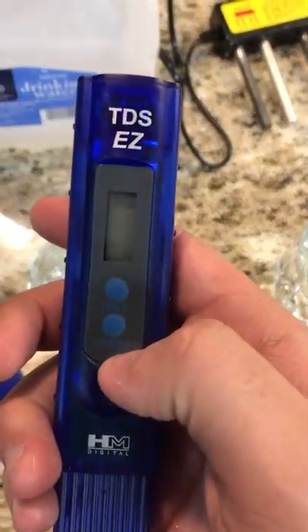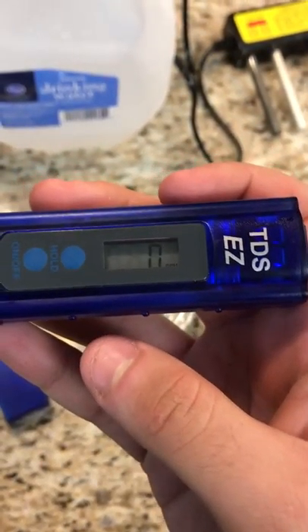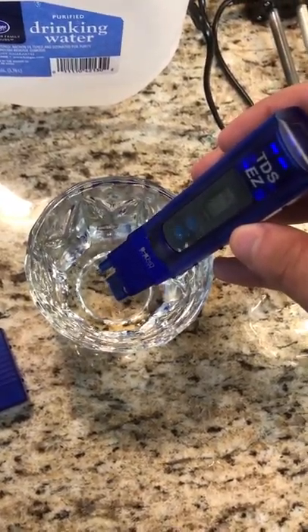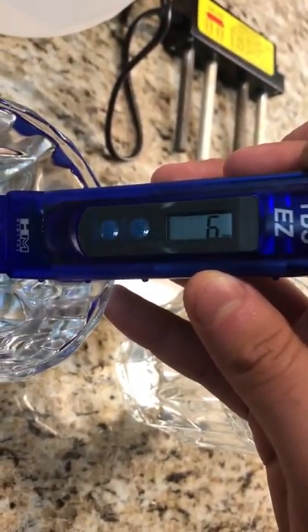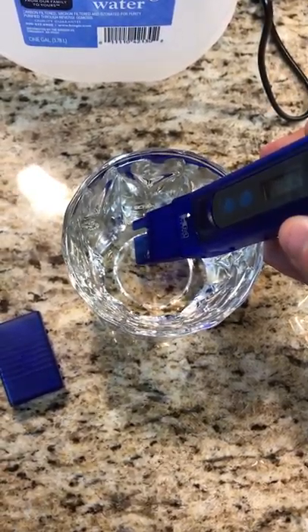We're going to turn it on — as you can see the reading is zero parts per million. We're going to put that into the water and let it sit for a couple of seconds to see what it reads. As you can see, it's only reading six parts per million, which is really good for the water — that only means there are six parts of dissolved solids in the water for every million particles of water.